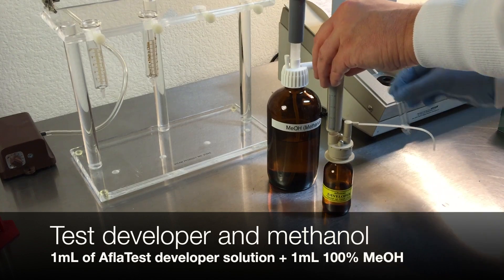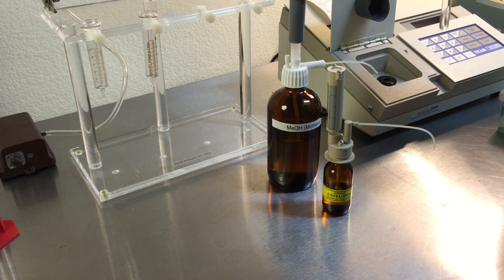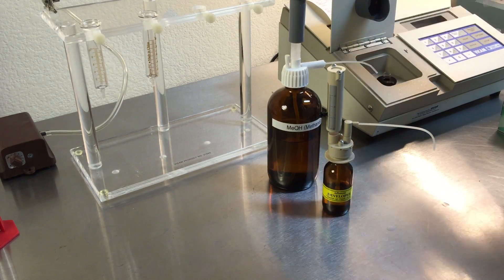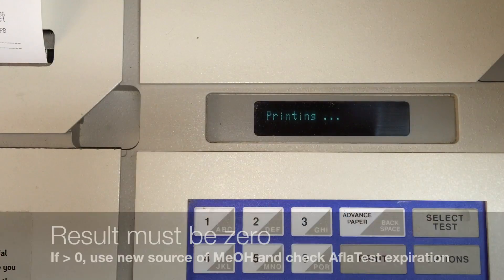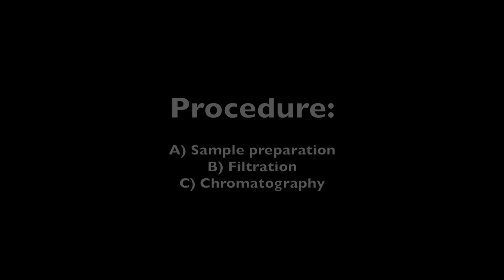Test the methanol and mixed Aflatest Developer solution for fluorescence. Using the calibrated pump bottles, pump 1 milliliter of methanol with 1 milliliter of Aflatest Developer and insert into the fluorometer. After 60 seconds, check that the result is zero. If not, find a new source of methanol.